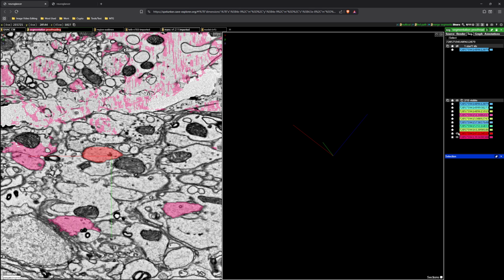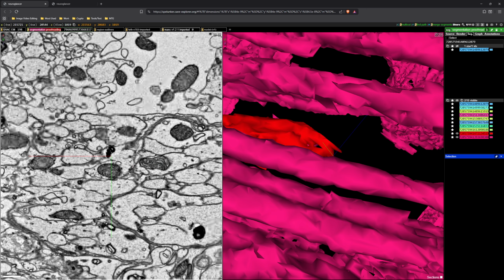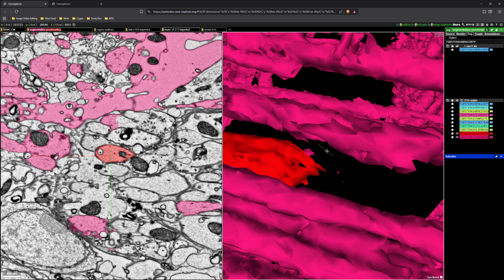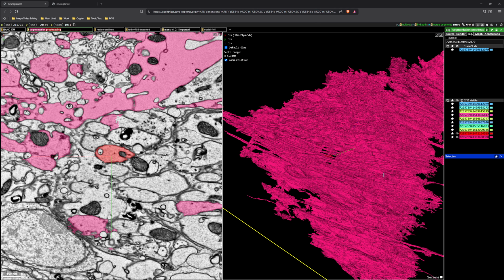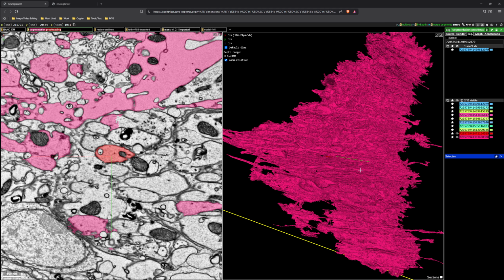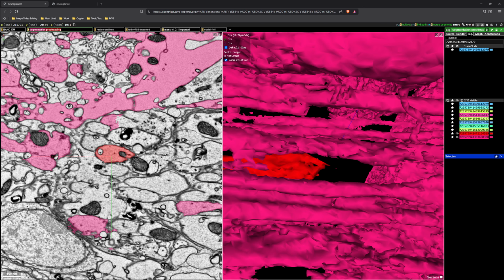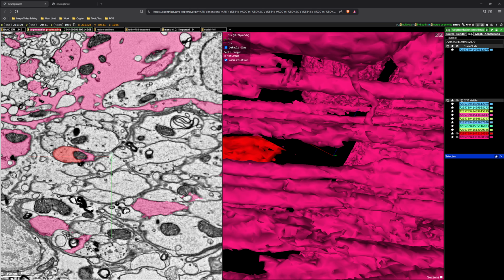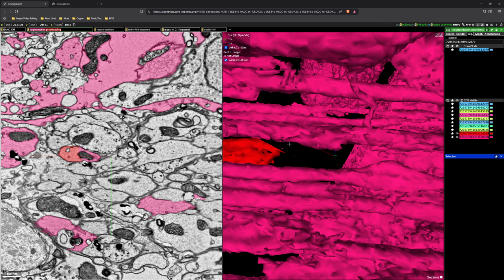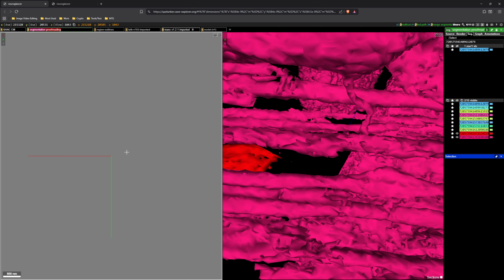We have 2 different distinct segments in the list now. We're getting the 2D before 3D, so we can do a quick investigate there. Let's get a zoom out. Perhaps we did not cut all the way. Yeah, it looks like we just got a sort of middle segment part. So this would be the equivalent of the pink segment from the first example. So we're going to scroll on down.